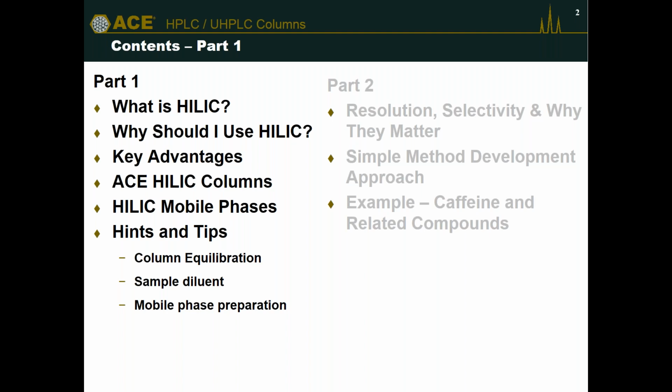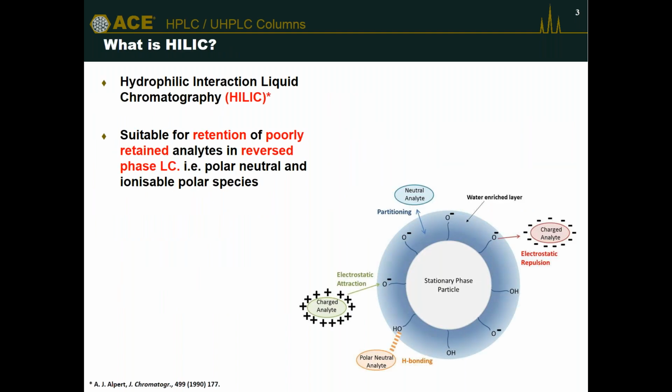So, what is HILIC? Hydrophilic interaction liquid chromatography is a technique, or an acronym certainly, that was first coined and reported by Andy Alpert in the Journal of Chromatography in the early 1990s. HILIC is a technique that's suitable for the retention and separation of compounds poorly retained in reverse phase chromatography.